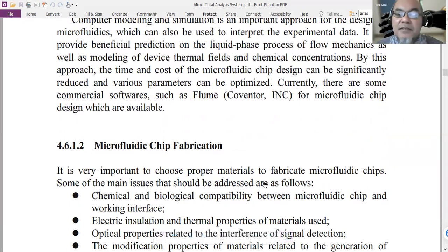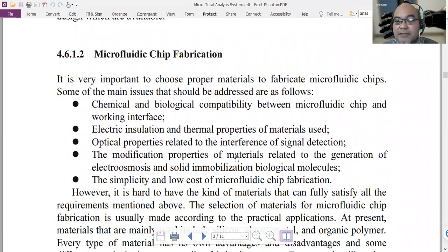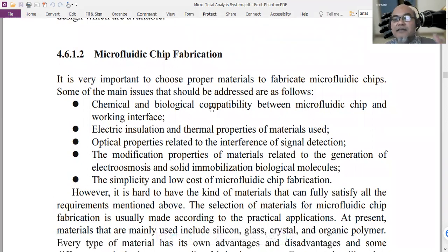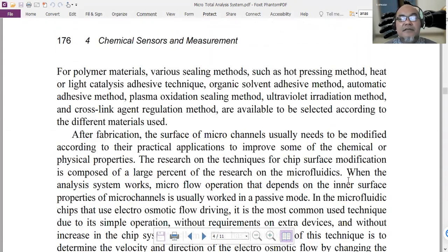The microfluidic chip itself is usually currently designed using glass material, using microelectronics technology, yeah, with etching, bonding, and patterning, etc. Although our lab, which I already started since when I worked at UTAS Malaysia, is trying to work on it using fabric-based devices. Yeah. So we'll just look.